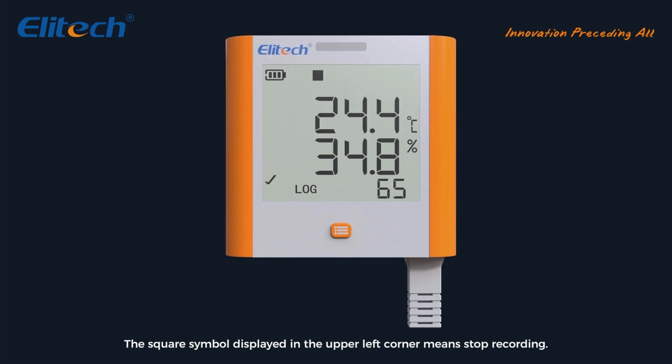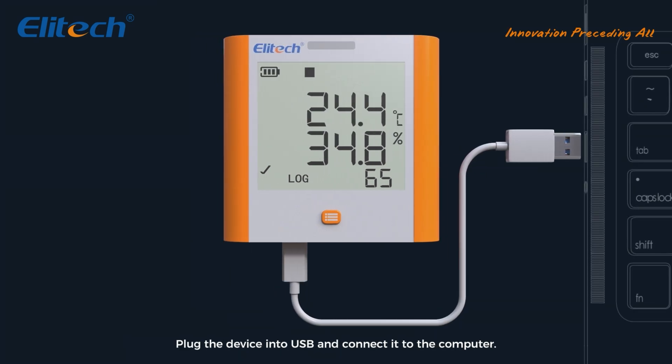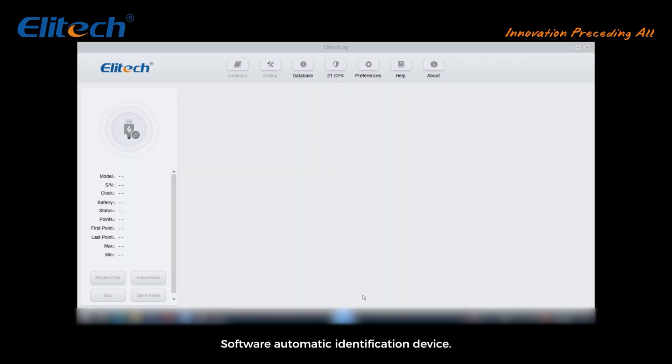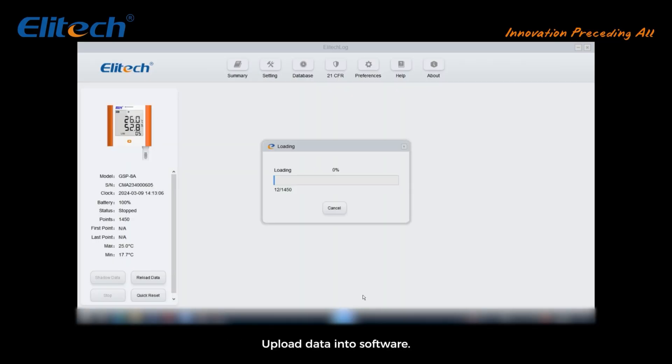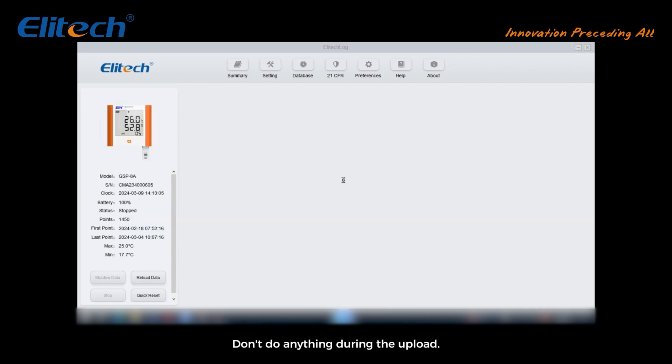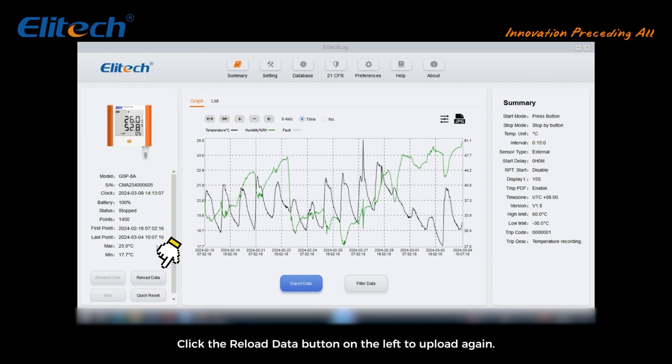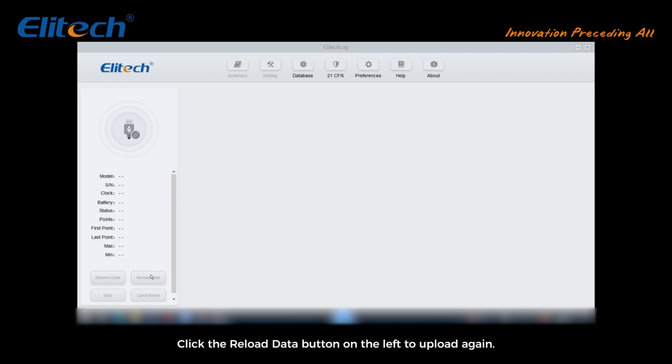Plug the device into USB and connect it to the computer. Software will automatically identify the device. Upload data into software. Don't do anything during the upload. Wait to complete. If not uploaded successfully, click the reload data button on the left to upload again.